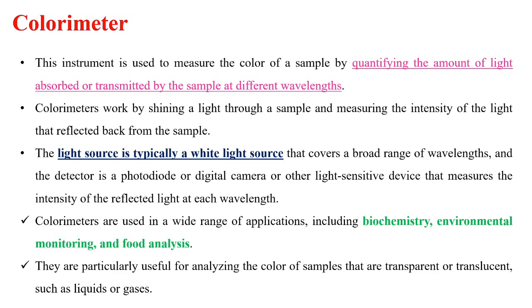Then coming to how the colorimeter works. The working principle of reflective spectrophotometer and colorimeter is a little bit the same. It has a source of light, you have a sample, and you turn on the light to get the reflected light back to the detector.